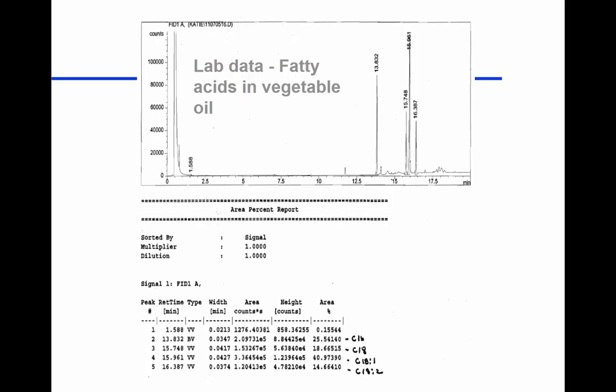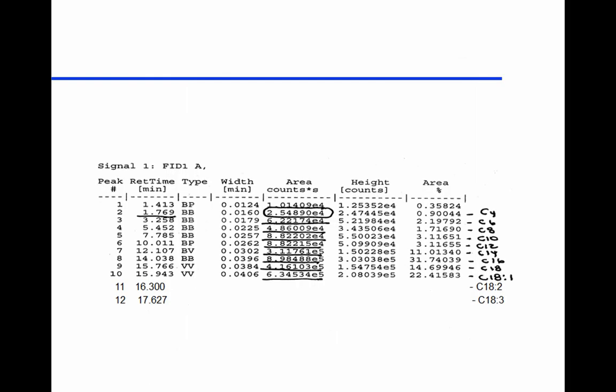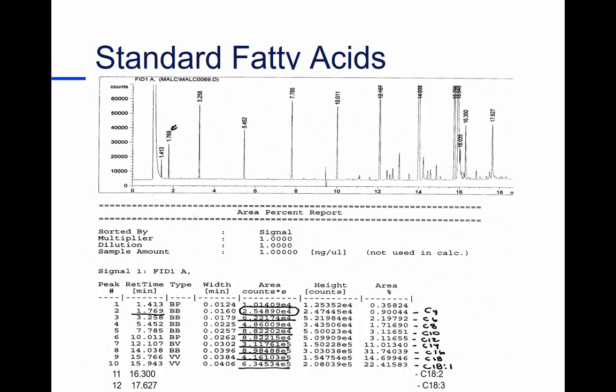Butter, dairy, mammalian milk, you bet. Anytime you find butyric acid, you find some of these little, small, short-chain ones, they will come from dairy sources, mammalian milk. If you were running this, nothing else happens until you get out about C12, which must be about here, and you get a nice peak at C12 and then the rest, you're looking at coconut. And so you could look at that profile and have a pretty good idea.